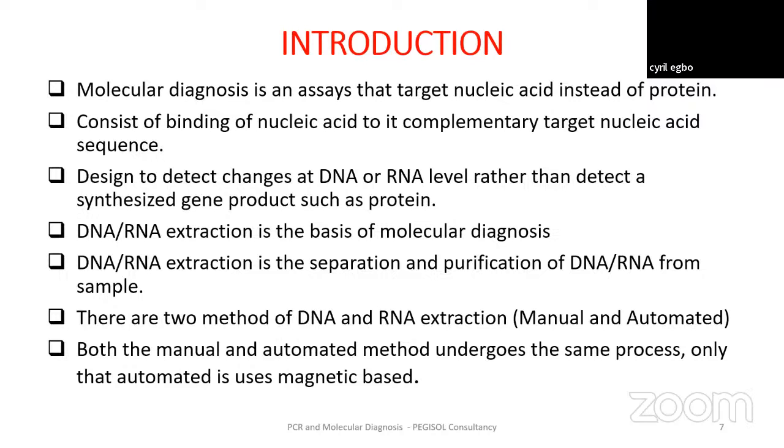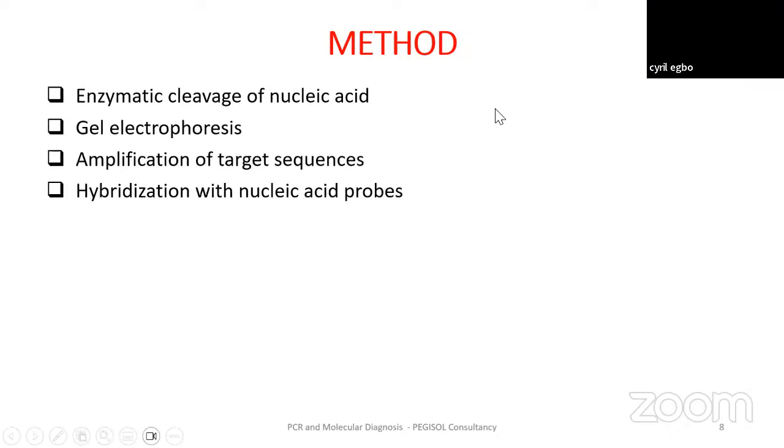And there are two methods of DNA and RNA extraction. You can either use the manual method or the automated method, and both of them undergo the same processes.